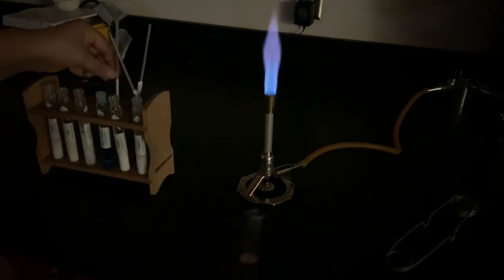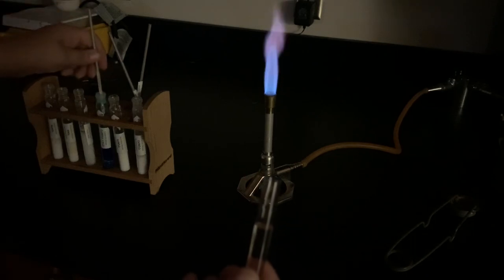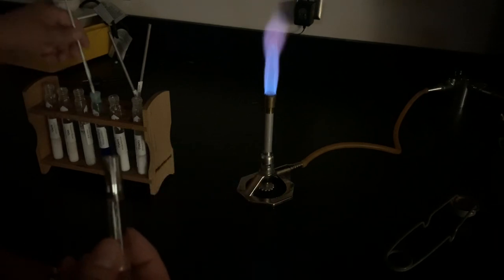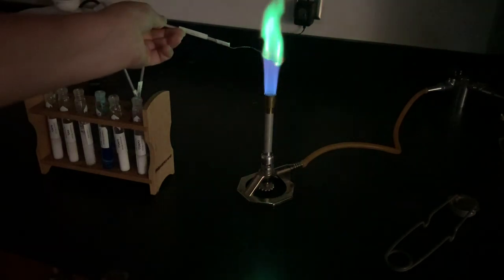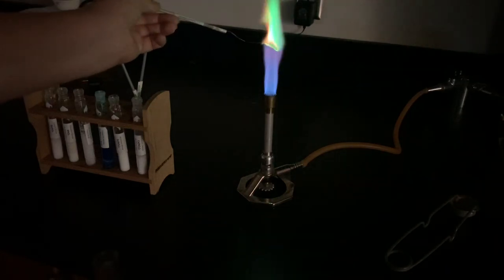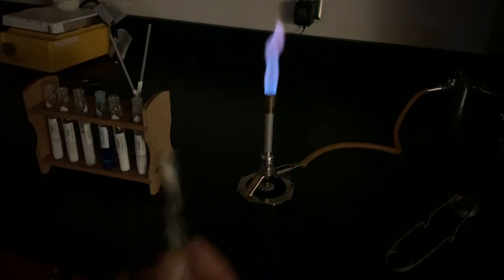Next I'm going to do copper with a clean inoculating loop and clean water. This is copper nitrate. Copper is fun — we use copper in a lot of TV and movies because it burns that nice green. When they want to make a witch's potion or similar effects, they'll often use copper.